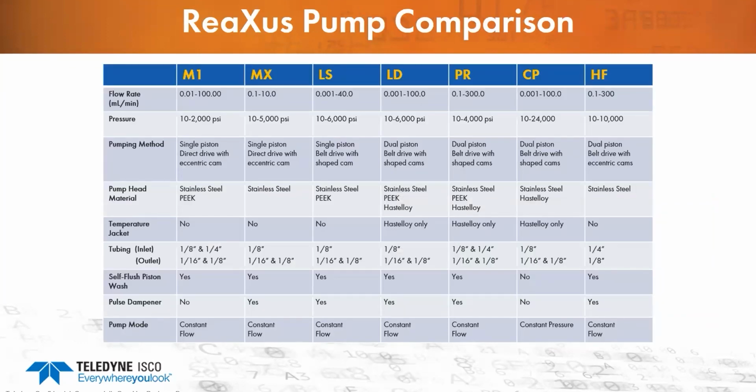This is a great table to have and to use that gives you the ability to compare all reciprocating pump models based on the pump head configurations, flow rates, pressures, and various types of offerings that these pumps can offer. So that's a great table to have with you when you consider various models of reciprocating pumps.